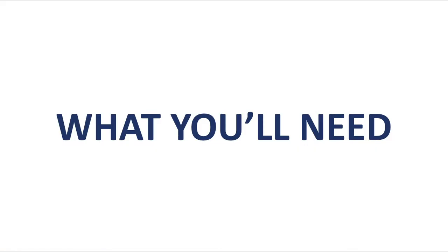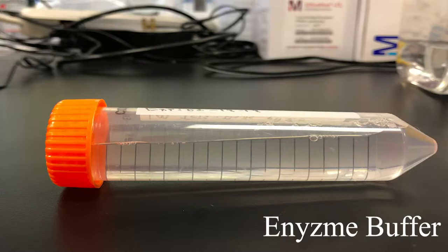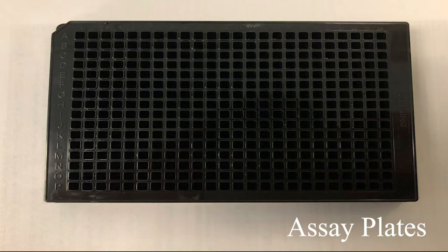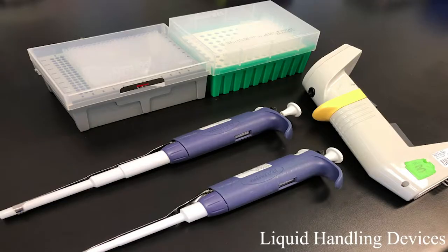Required to run an assay but not included in the kit: Ultra-pure water — some deionized water systems are contaminated with nucleases that can degrade both nucleotide substrates and products, reducing assay performance. Enzyme buffer specific to your enzyme may include a variety of components; please see the user manual for a summary of additive effects on the assay. Enzyme: TransScreener ADP assays are designed for use with purified enzyme preparations. Assay Plates: it is important to use assay plates that are entirely black with a non-binding surface. We recommend Corning 384-well plates, catalog number 4514. Liquid Handling Devices: use liquid handling devices that can accurately dispense a minimum volume of 2.5 microliters into 384-well plates.